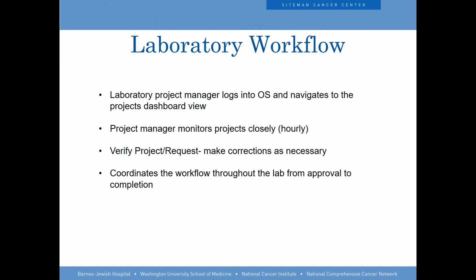There is a question from Nitin: do you have to develop and maintain a separate database for the project tracker, or is it based on the same database? Let me take that. Nitin, it's in the same database. So from an operations point of view or from an IT management point of view, there is pretty much nothing that you need to do. Everything is in a single database.